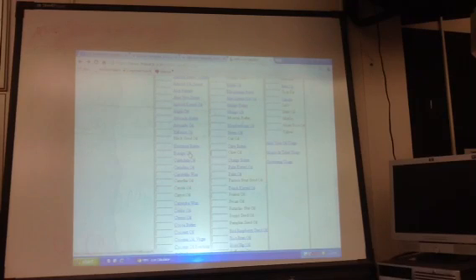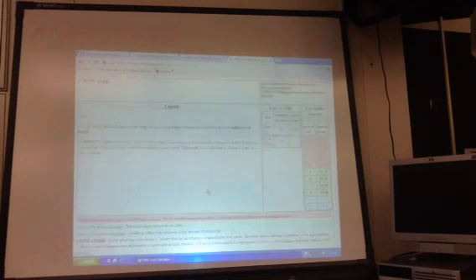What we're going to do is we're going to go in here and we're going to plug in that, is it 96? It's 95.5? We're going to do two sig figs and say 96. And we're going to see what it gives us. So what this will come up with is it will tell us how many grams of lye we need to use for what percent excess. So you'll see how the results look here. So I hit that, and I'm going to hit enter.